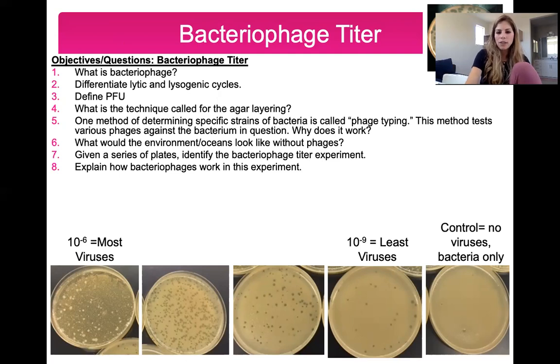Explain how bacteriophages work in this experiment. So we talked about them lysing the bacteria. What is the purpose of serial dilution? So go through all of this, and I think you guys have everything you need to understand this lab.